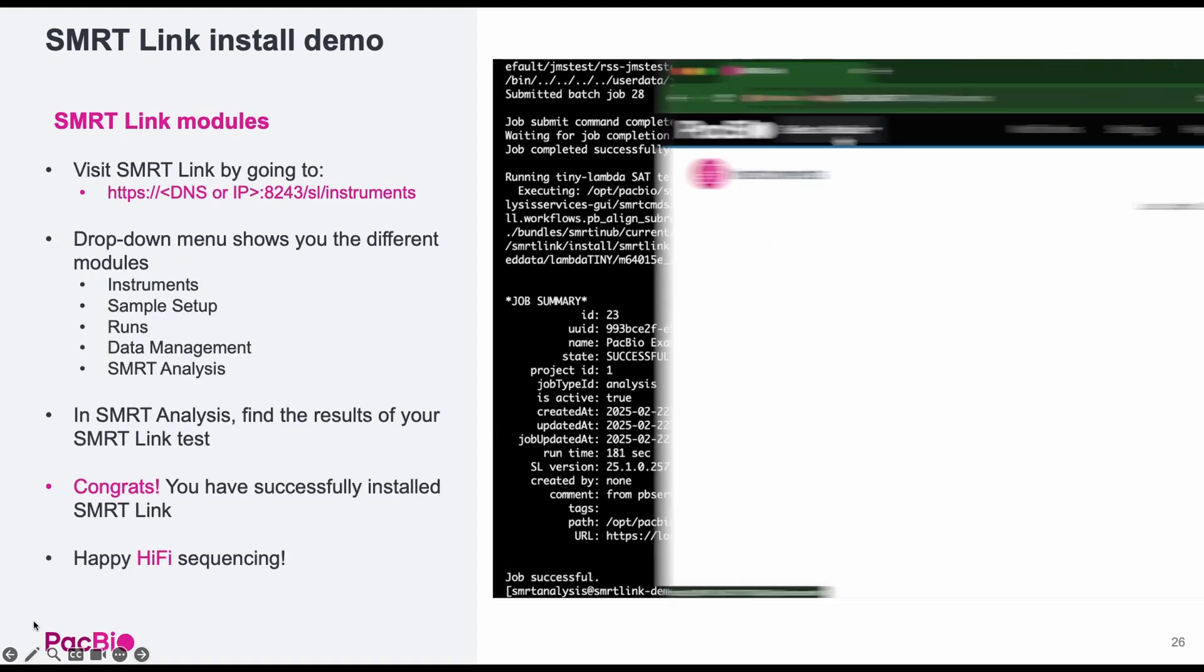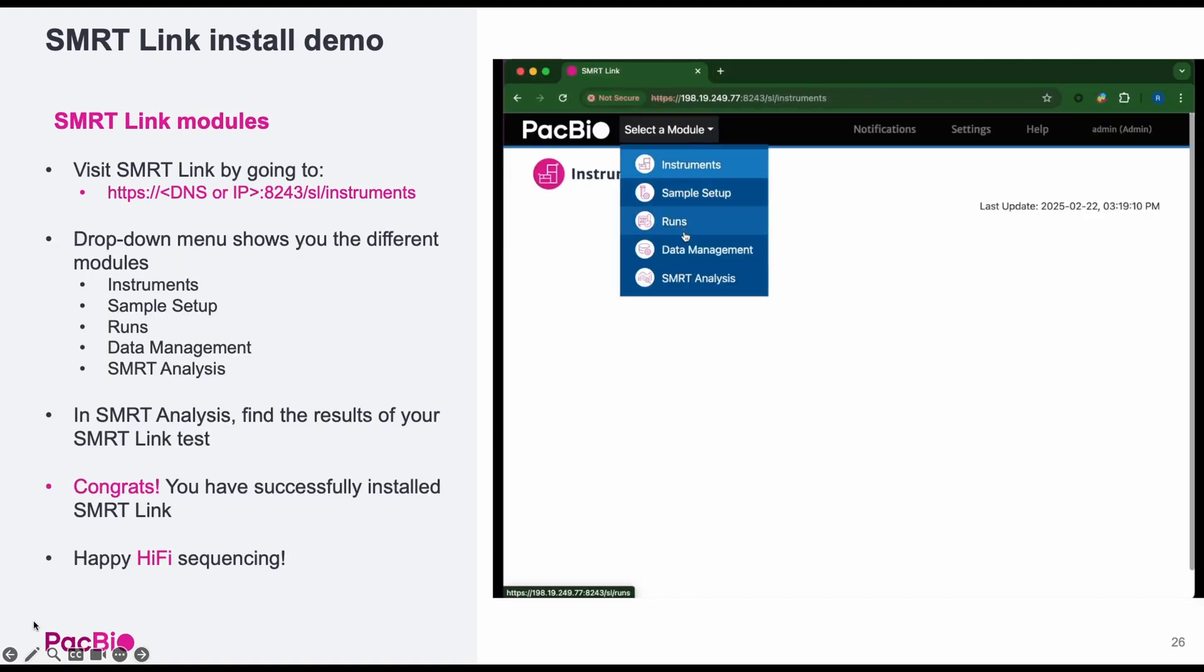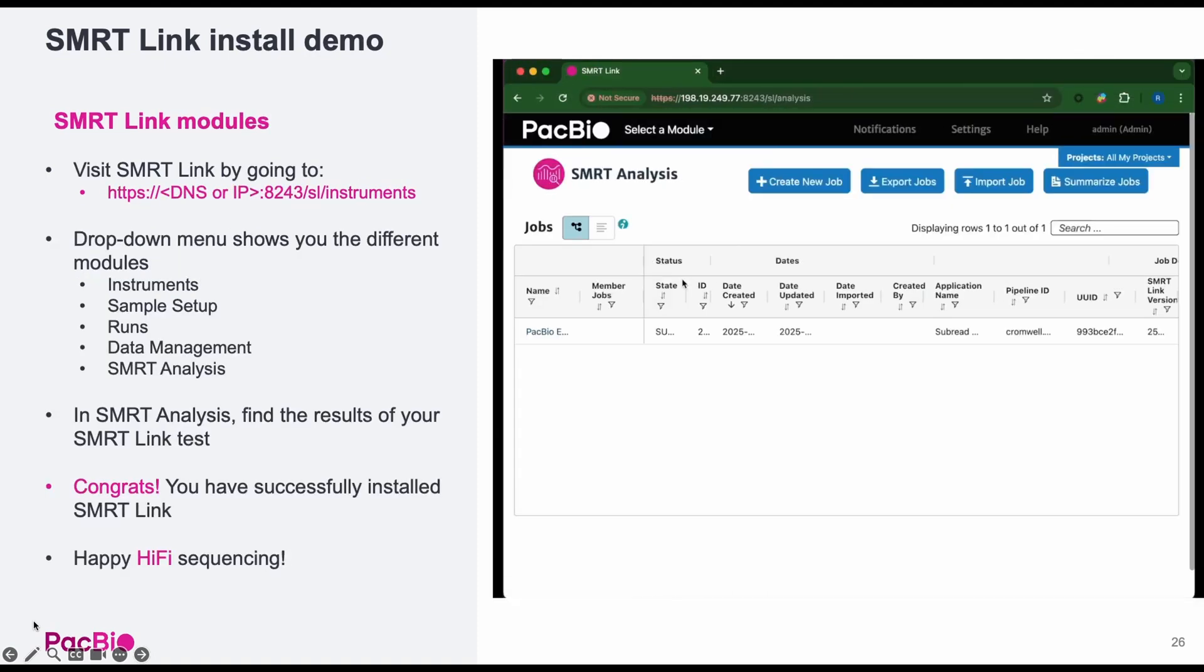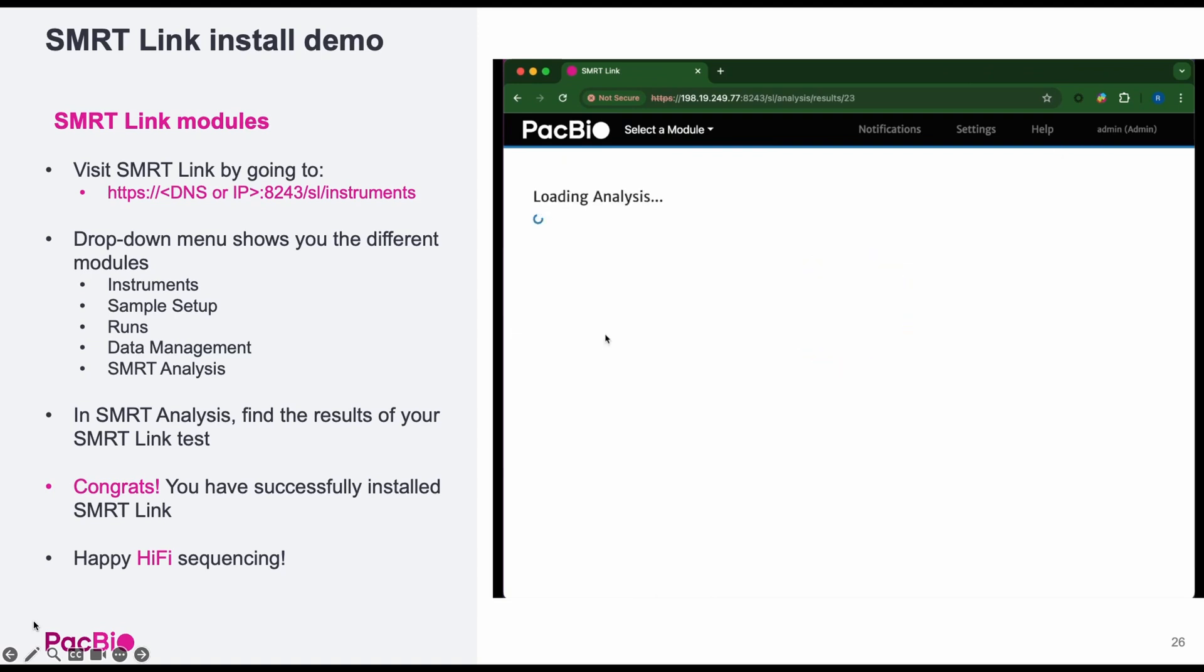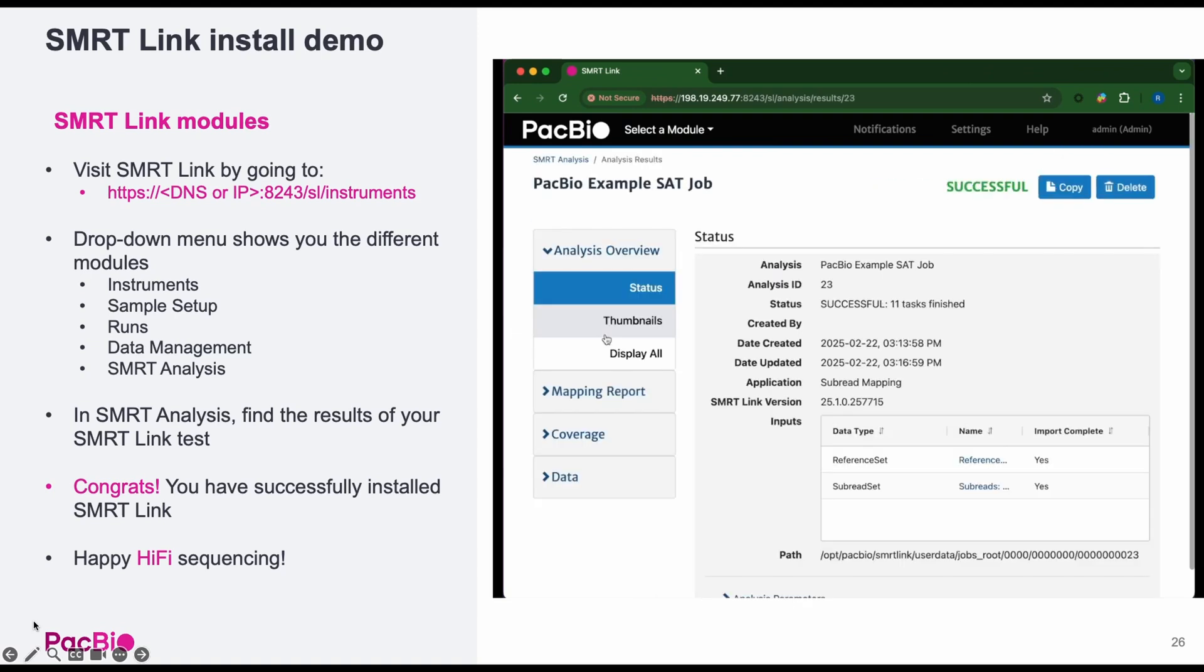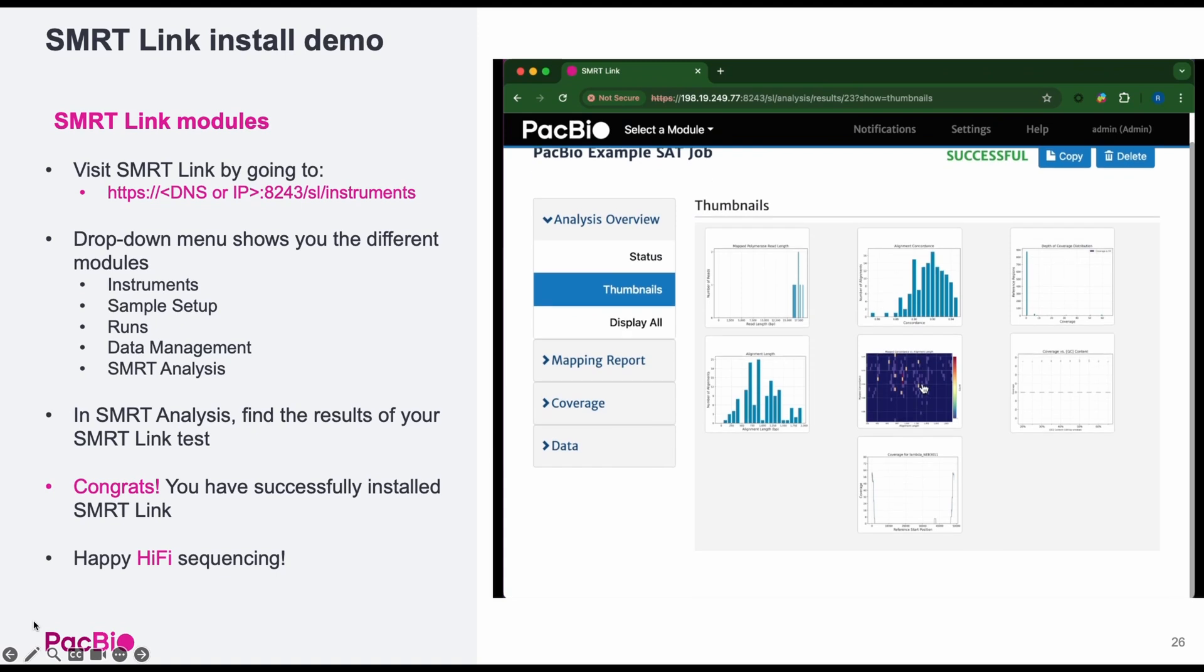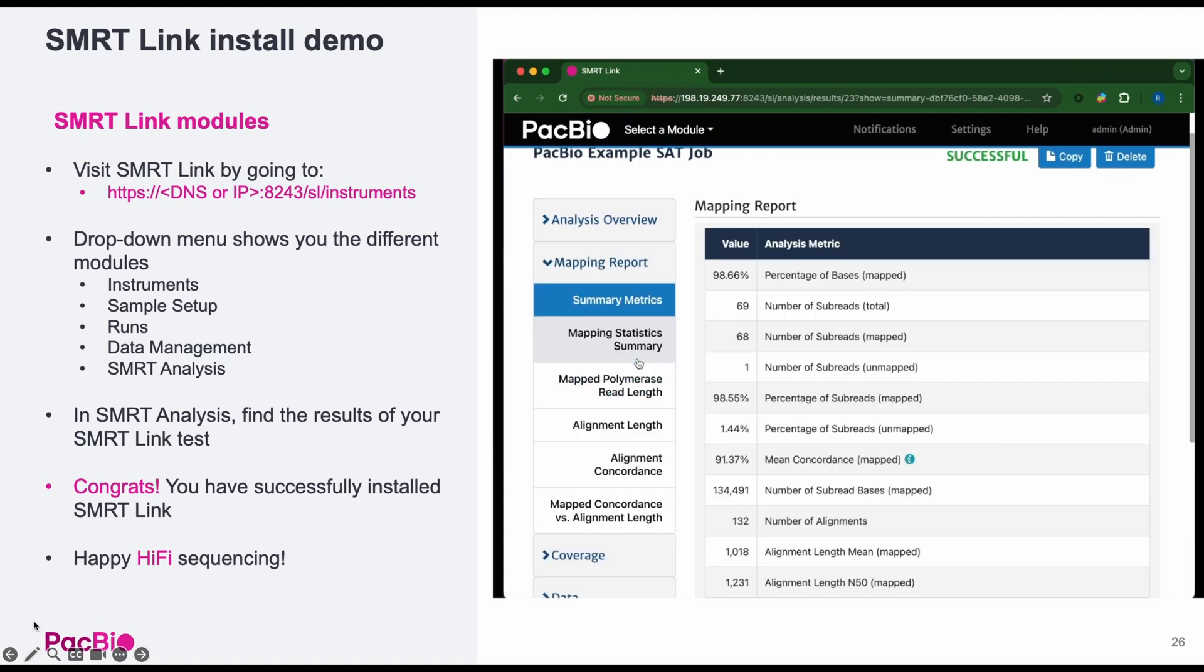Back in SmartLink's web interface, you'll find the different modules. And specifically, the smart analysis module, you'll find the test job, which you can open to view various metrics about the analysis results.